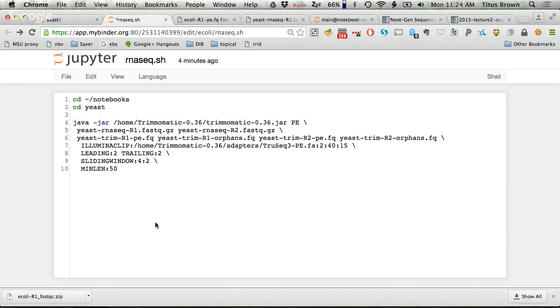Okay. You're also going to be really tempted at some point, and it may not be you, maybe somebody working with you, to just go through here and go, well, I don't really like the number 50. I want to change the number to 55 because it's Thursday. People seem to do this a lot. It's the equivalent of putting your own stamp on your experiments. I really wouldn't bother. Just pick some numbers that you're going to use for all your experiments. Use them. Don't think about them until you have a reason to change them.